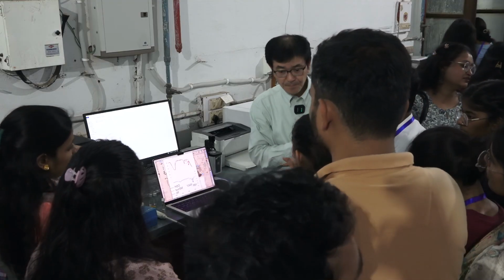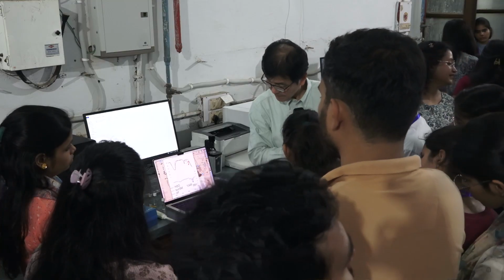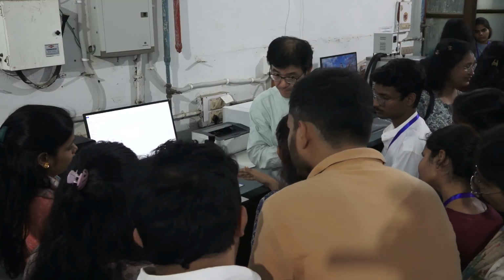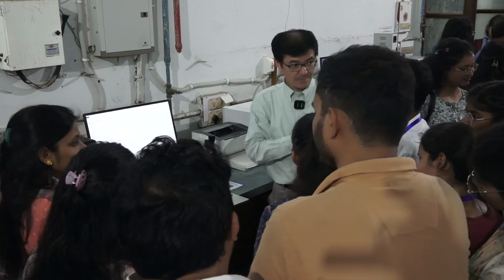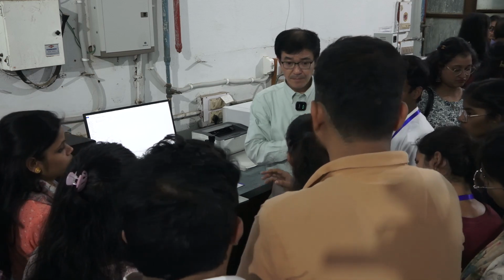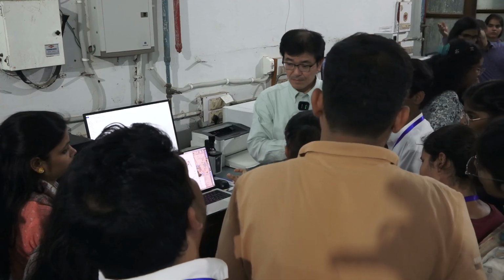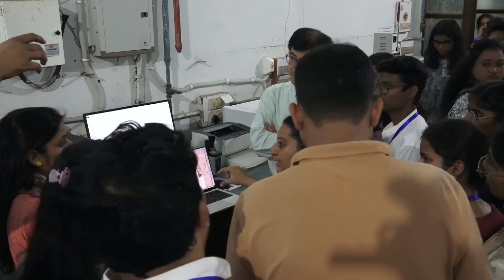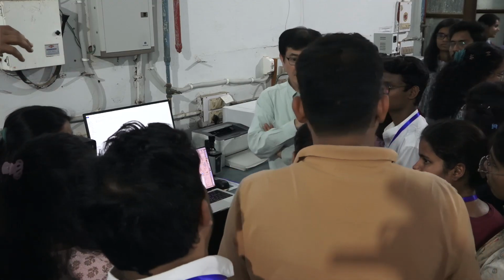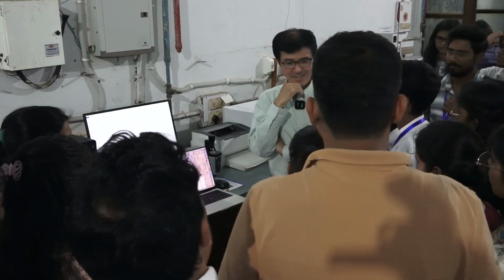So, is there some kind of program or algorithm, some application maybe, that can identify an unknown compound spectrum? You mean a database? Yes, sir. No, rather than database, a database would match the values, something to identify a new spectra. Perhaps it could have the information for all the existing? Probably there is no such a convenient one.